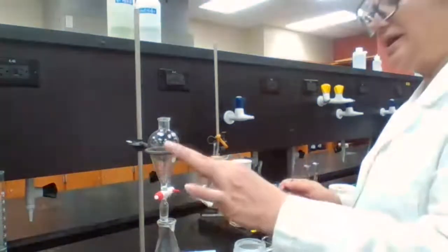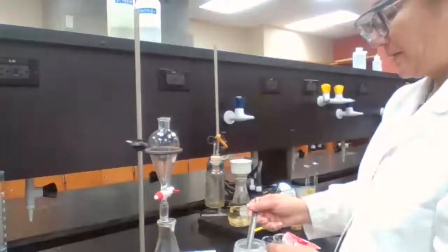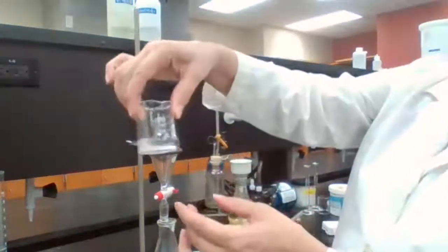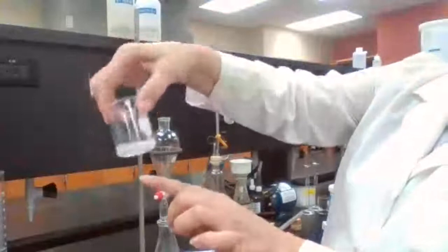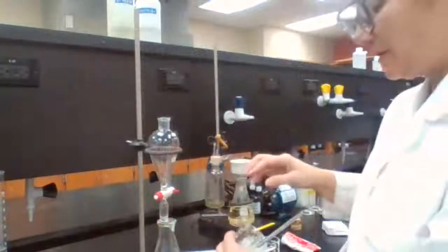How much should I add until I get a clear solution? When the potassium carbonate stops clumping and the oily solution is clear, it means that all the water has been absorbed.